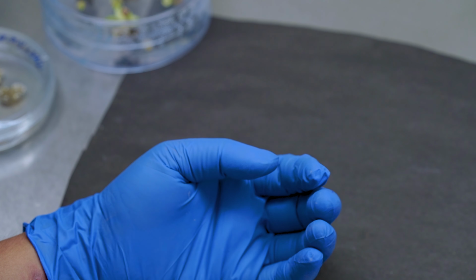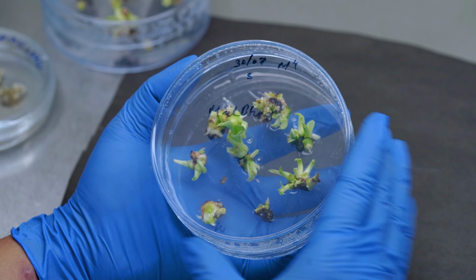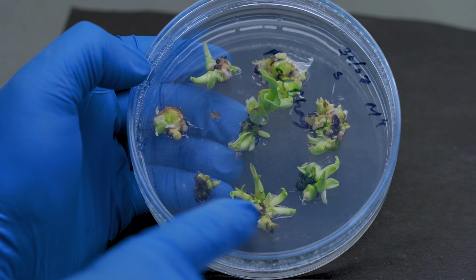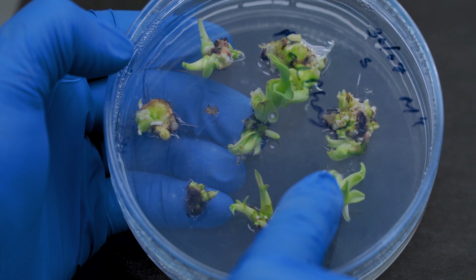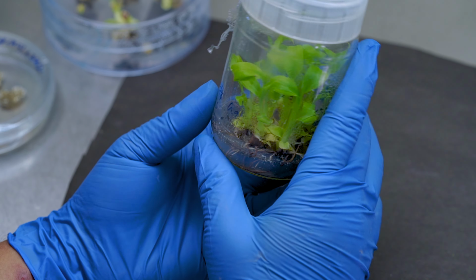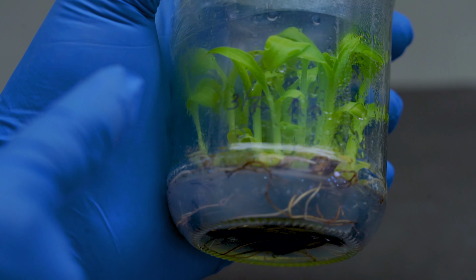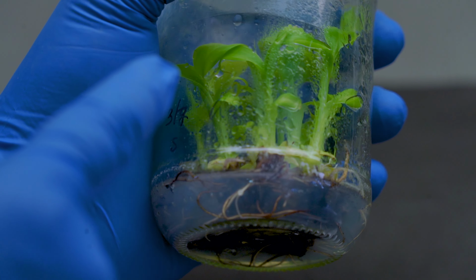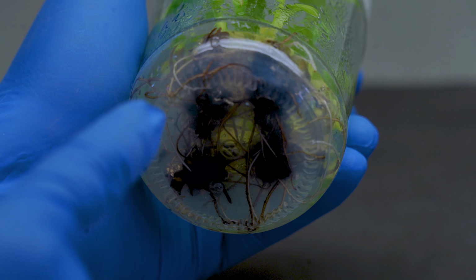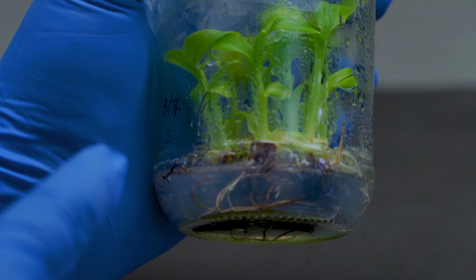Then we further subculture it into the same M4 regeneration media, where we can get multiple shoots from each somatic embryo. Then we're going to put those regenerated plantlets for rooting in a rooting media, and we're going to grow it for another 1 or 2 months. After that, individual plantlets will be taken, hardened and transferred to the greenhouse.